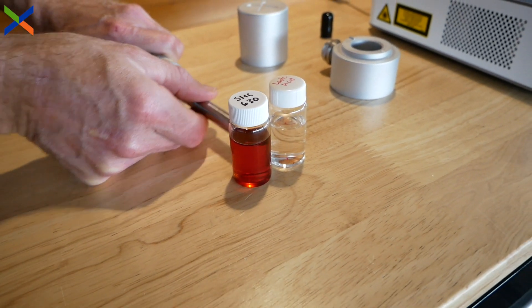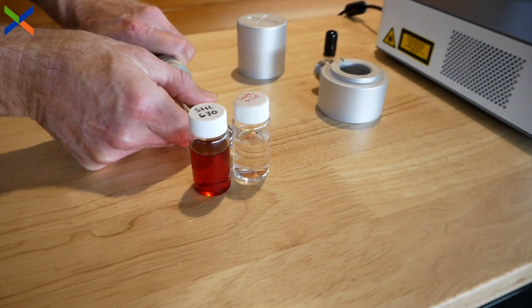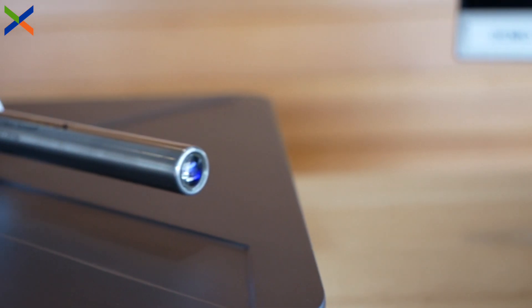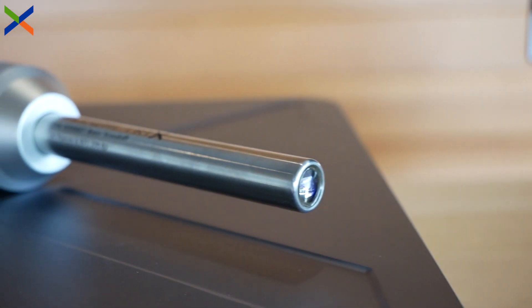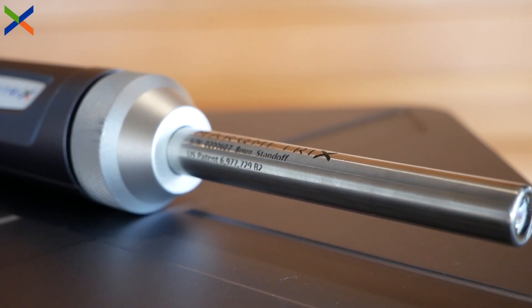The probe can be used for measurements of all sample types, though it excels at collecting measurements of liquids through glass or other containers, as you can see here. Featuring a sapphire lens and a high temperature composite adhesive, Proximal Ball Probe can operate continuously in temperatures ranging from negative 20 to 100 degrees Celsius.